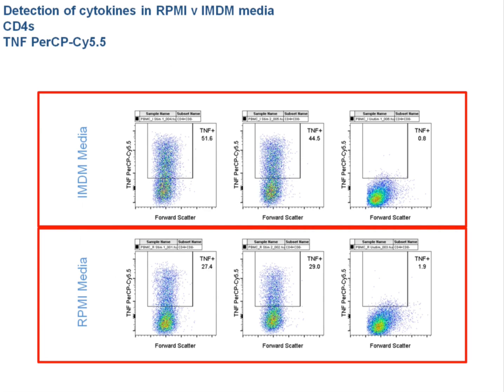Cytokine staining isn't a tool for your stimulation; it's really just a tool for identifying on the other end. If you're interested in the cytokines produced by those double negative cells, you can certainly use cytokine staining. Your surface markers may be, for example, CD4 and CD8, and you'll look for the cells that don't express either of those.